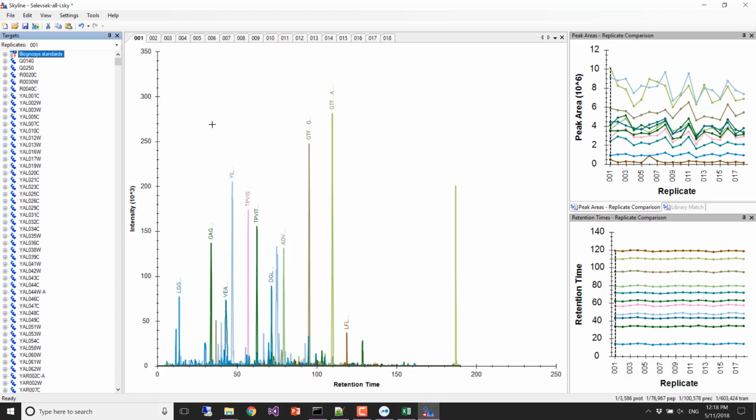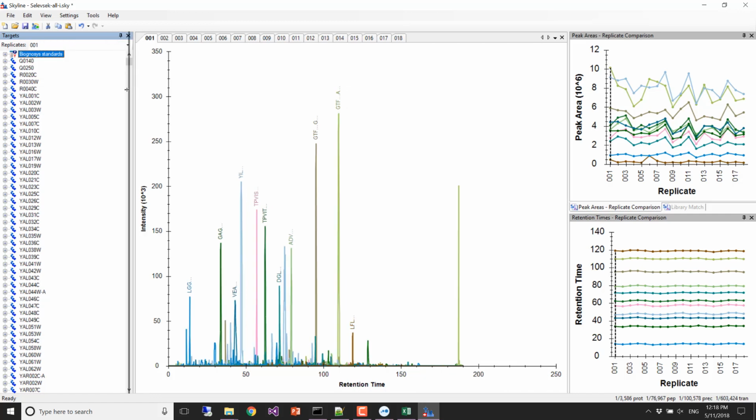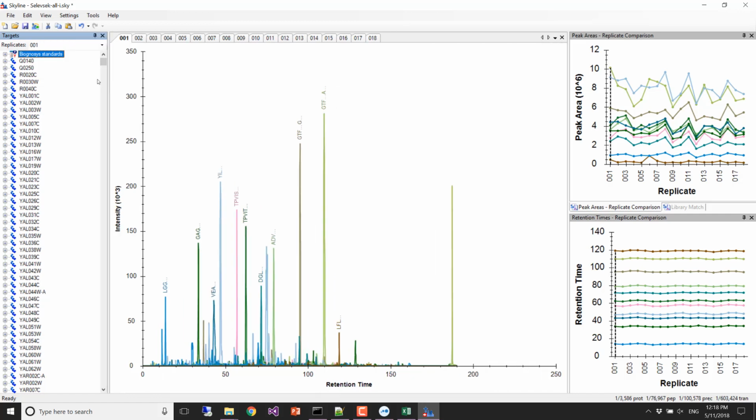So that was the filter we applied, and we lose peptides. Turns out we lose all of our reversed peptides if we do that. So by that reversed metric, we have essentially a false discovery rate of 0, and then we take that into our next round of measurement.